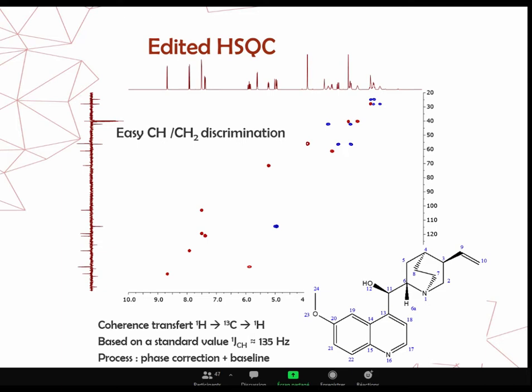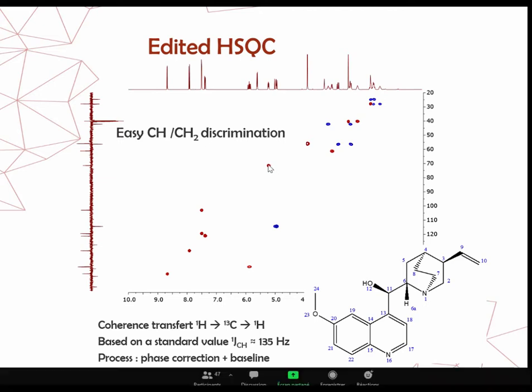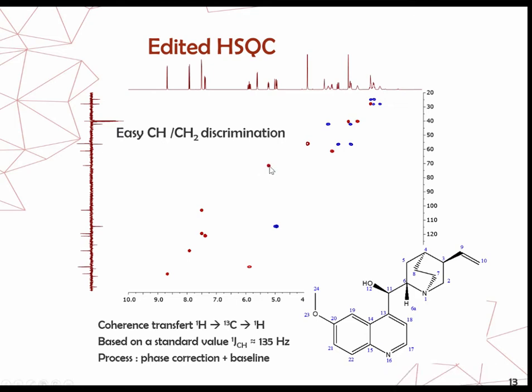When you have a compound and you need the characterization, you will get the proton spectrum, direct carbon, and instead of J-mode or DEPT, I encourage you to use only the edited HSQC, which is much, much quicker, and it will give you much more information, because you will get the DEPT information with the sign of the correlation peak, positive or negative.